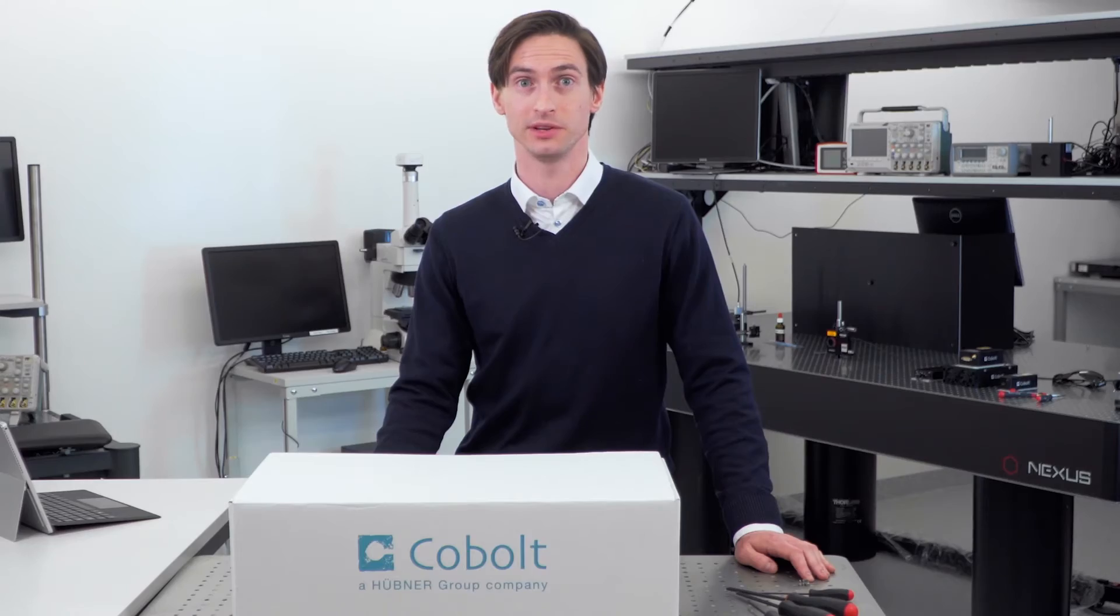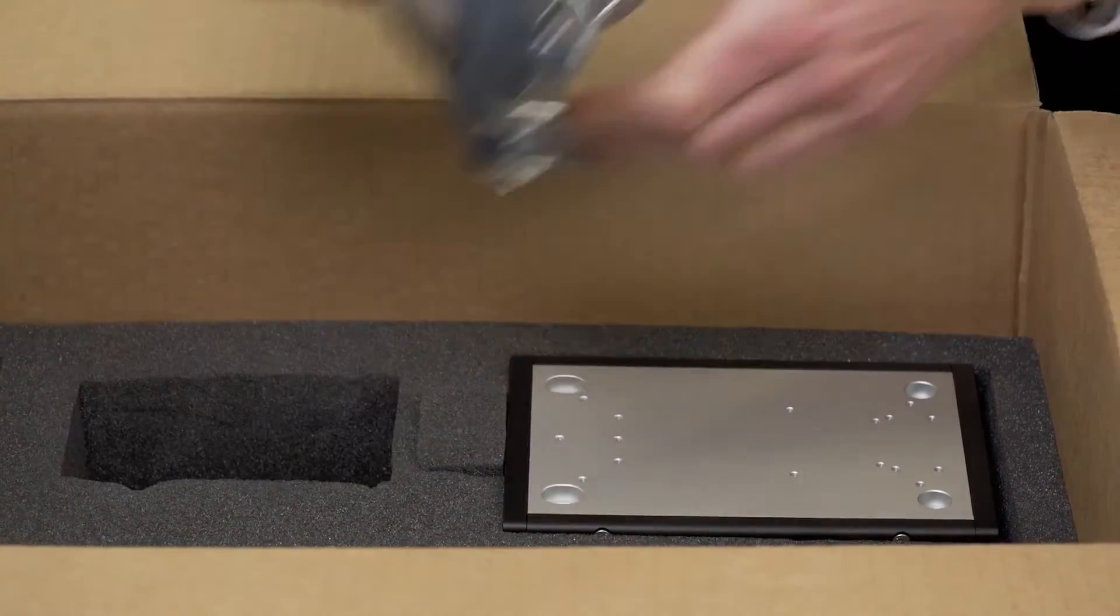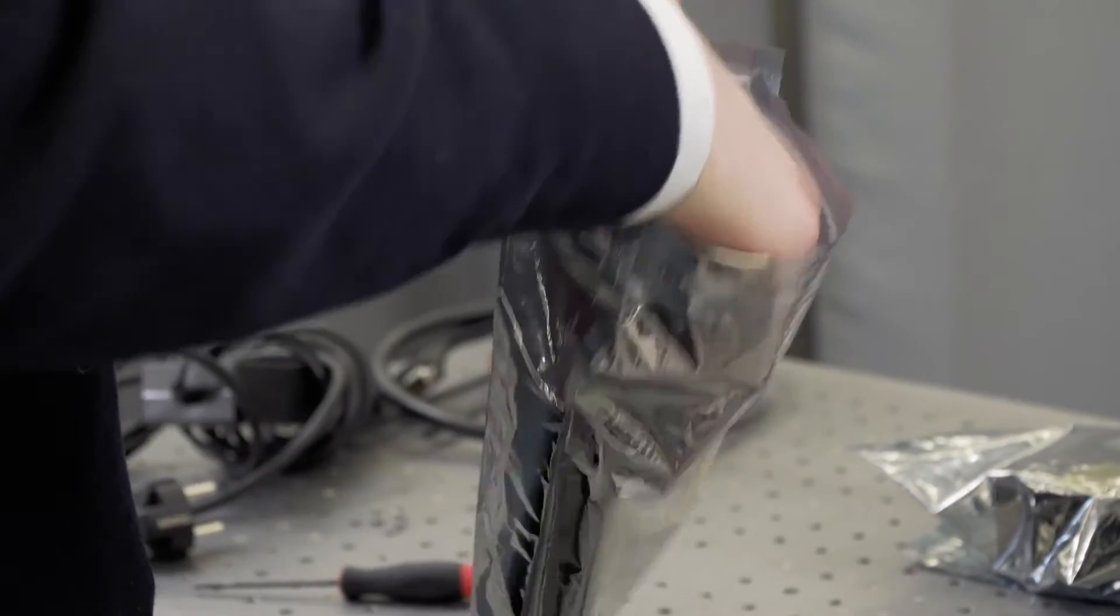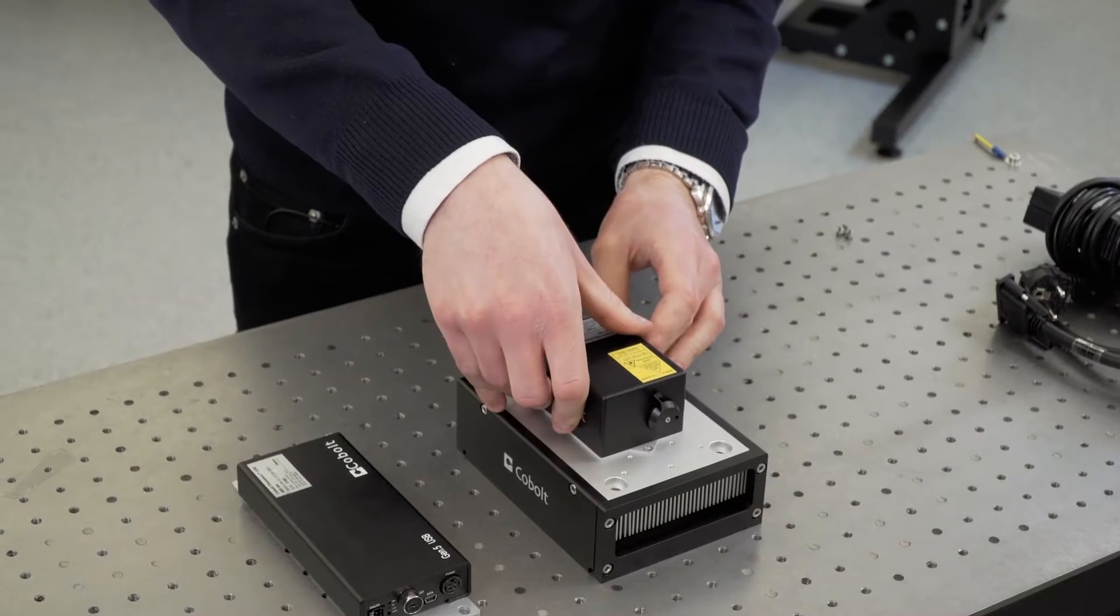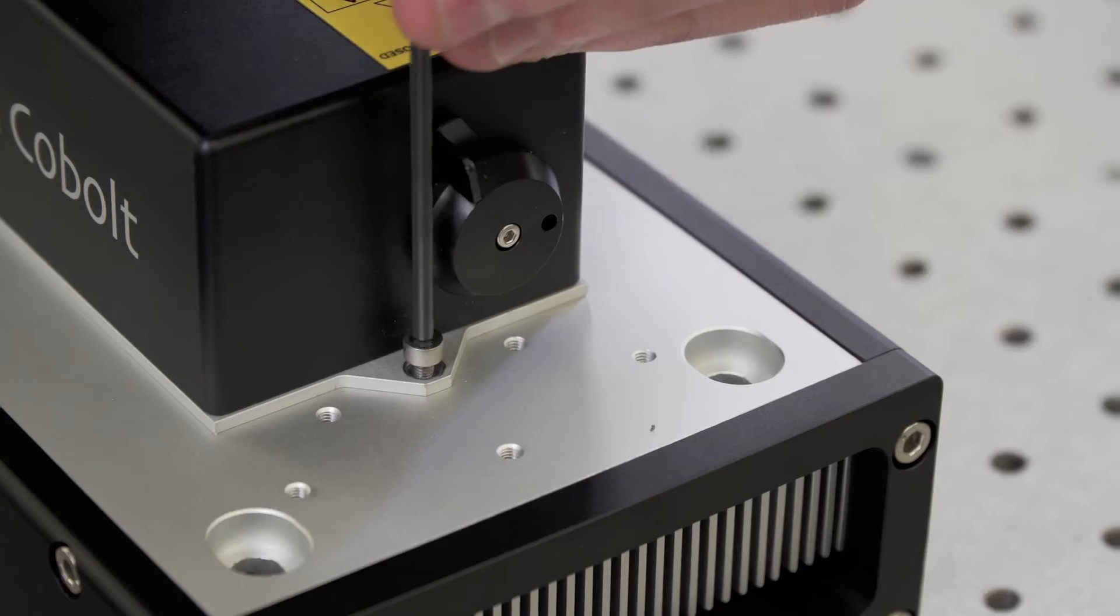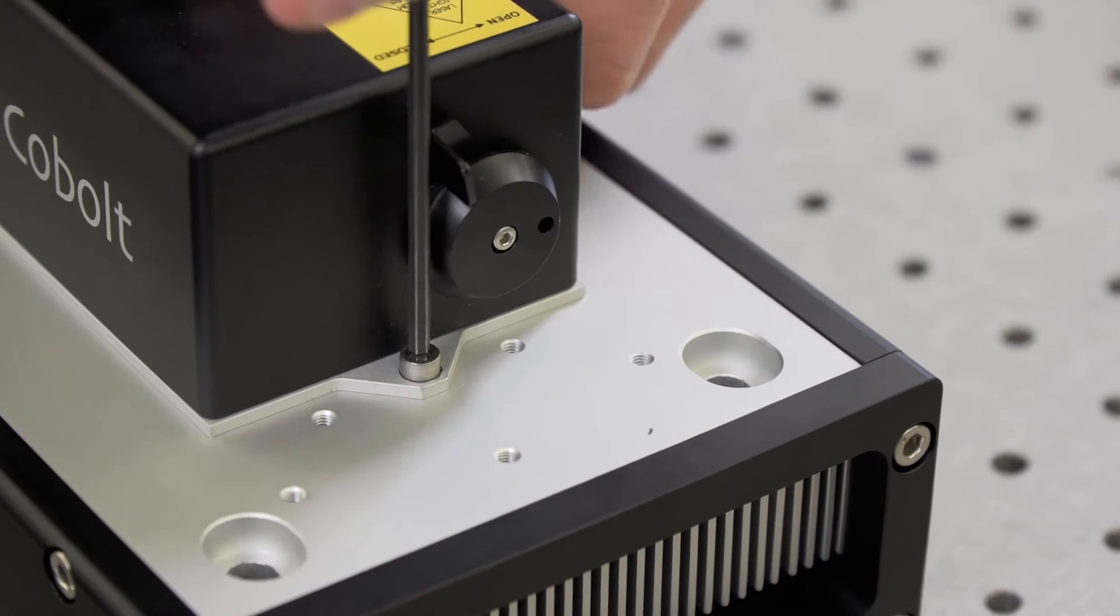If you have just bought a Cobalt laser, you'll need to take the laser head and the controller out of the ESG protective bag, assemble it and mount it onto the heatsink. It's important to have it mounted onto a heatsink to prevent overheating.